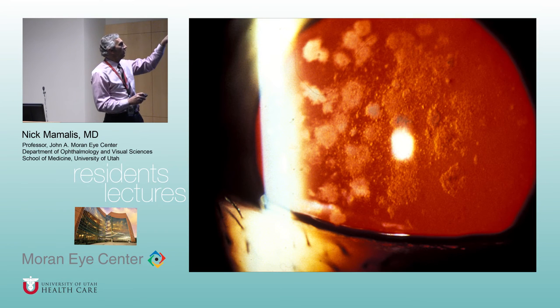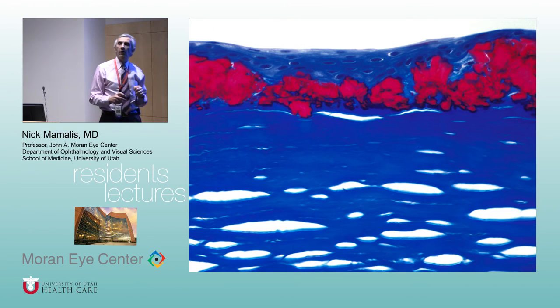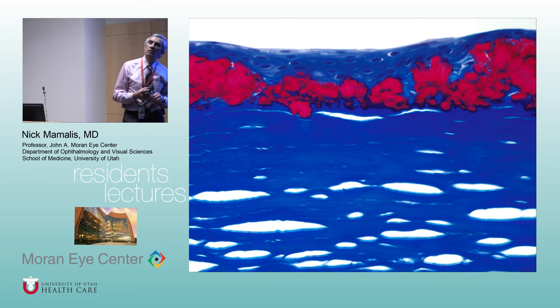And here you see on a retroillumination, the granular, H. What does that stand for? It's hyaline. And so hyaline, Masson's trichrome. So Masson's trichrome stands for the hyaline.